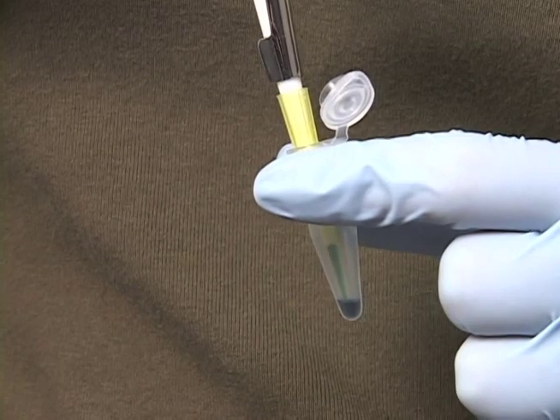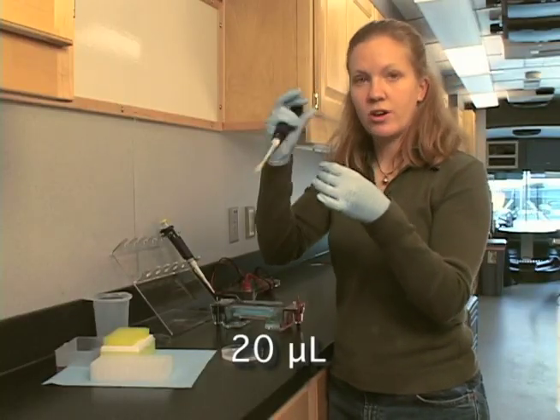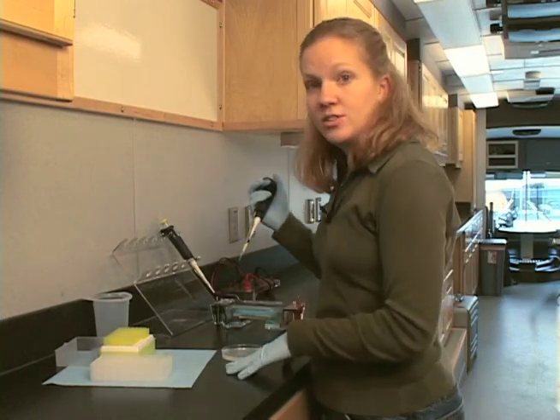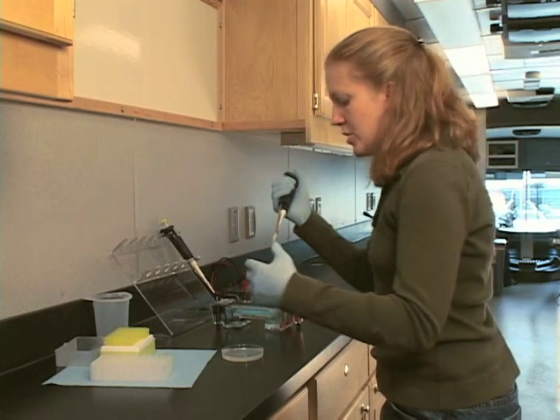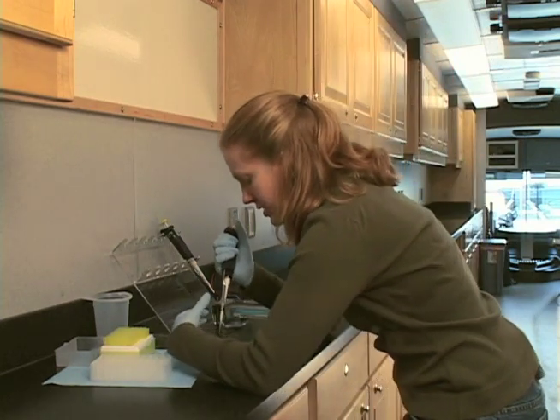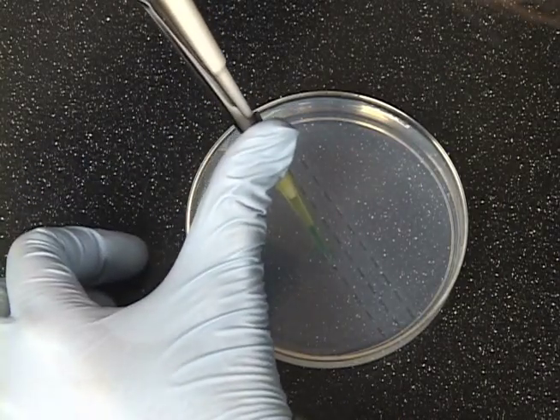The last time, go ahead and draw up your sample volume. In this case, we're drawing up 20 microliters. Now we're going to load it into the pipette station. You can do this however is comfortable for you, but I'm going to show you the way that I usually do it, which is to put the thumb of my free hand on the bottom of the pipette.